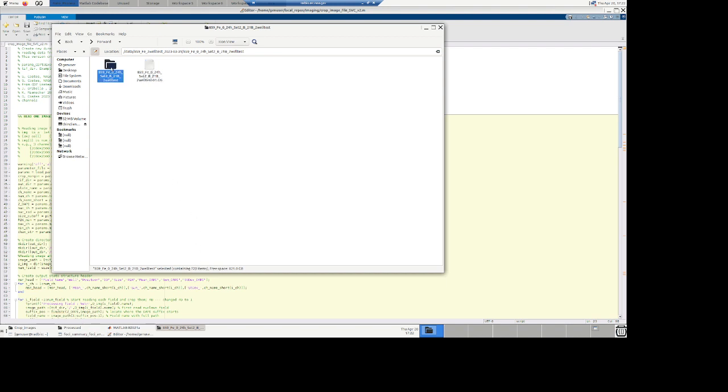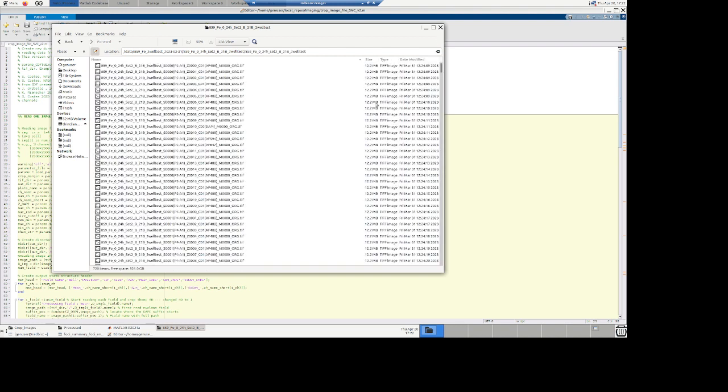Now, this is similar content, but split into TIFF images. So that's typically what we work with from the microscope we use currently, and that changes all the time depending on the instrument. That's why I wrote this script to be more general, but that script will still need to be adjusted based on the type of input. But just very quickly, let me walk you through the structure.